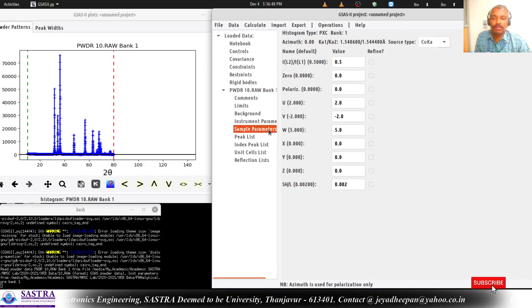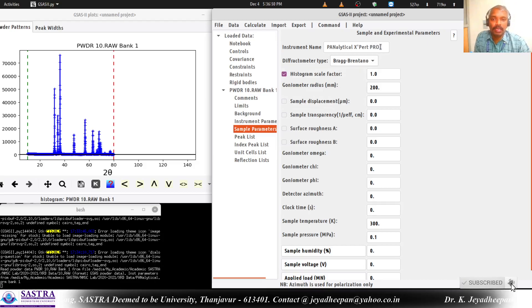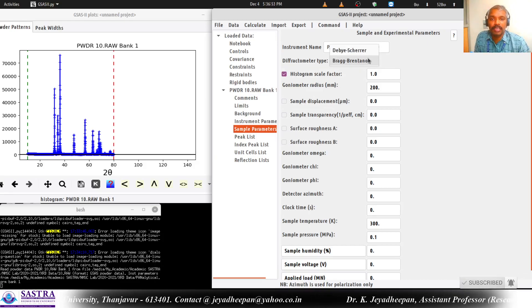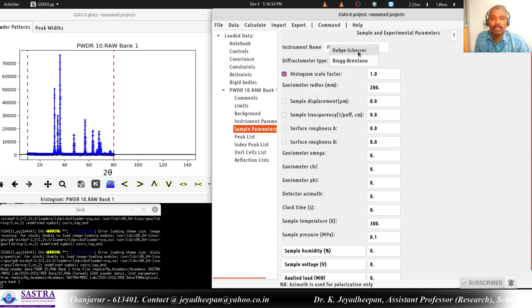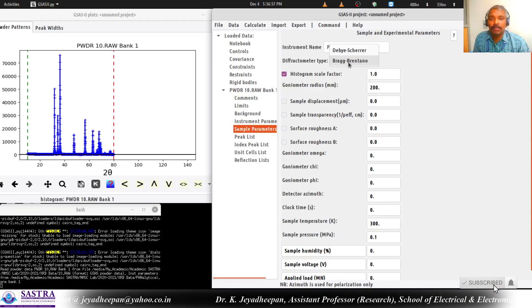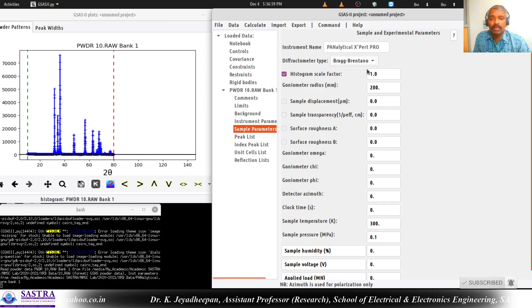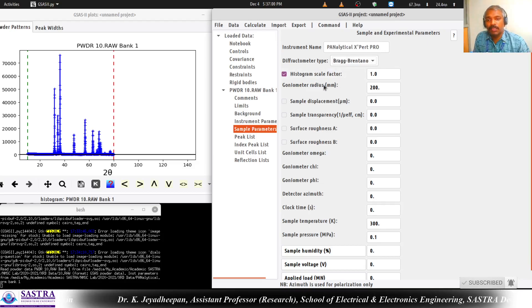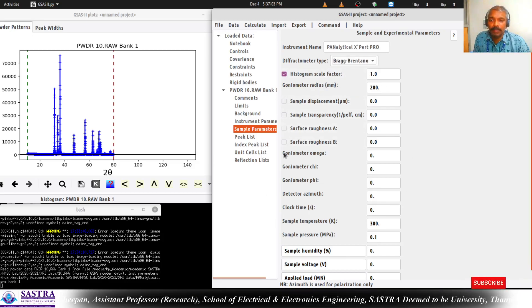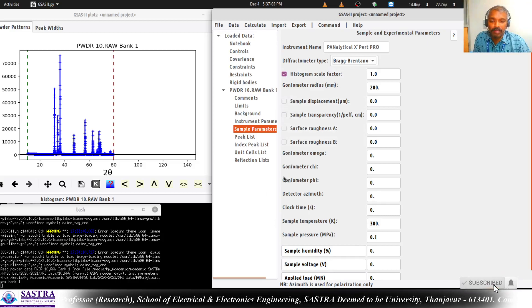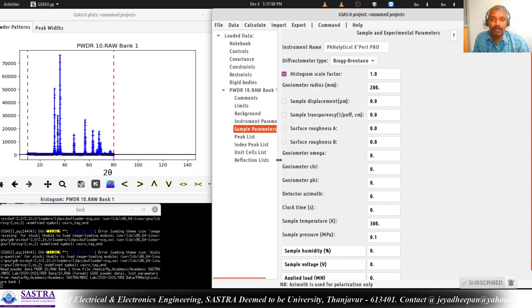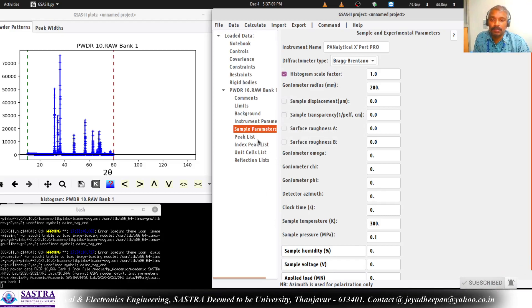Next go to Sample Parameters. Here ensure that the diffractometer type is not the Debye-Scherrer, Bragg-Brentano type, which is a commercial one. For semi-quantitative phase analysis we are not going to refine any of these parameters - those will be refined for Rietveld refinement itself. We don't need to bother about it now.